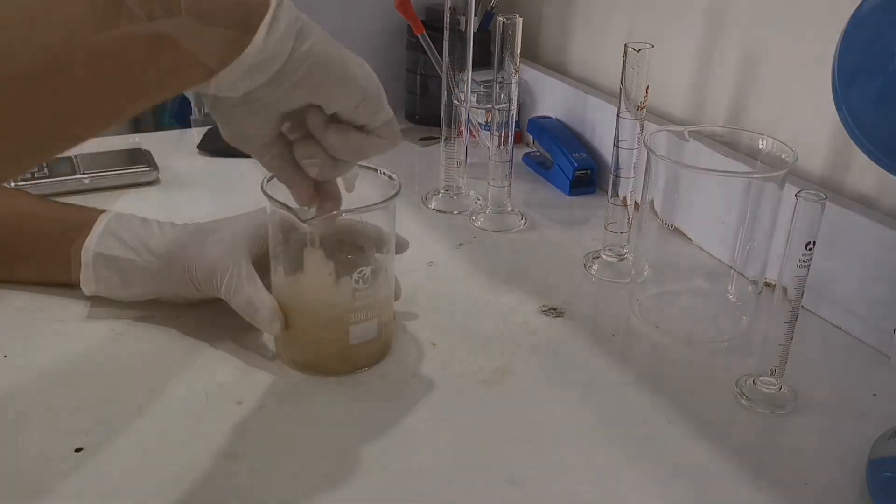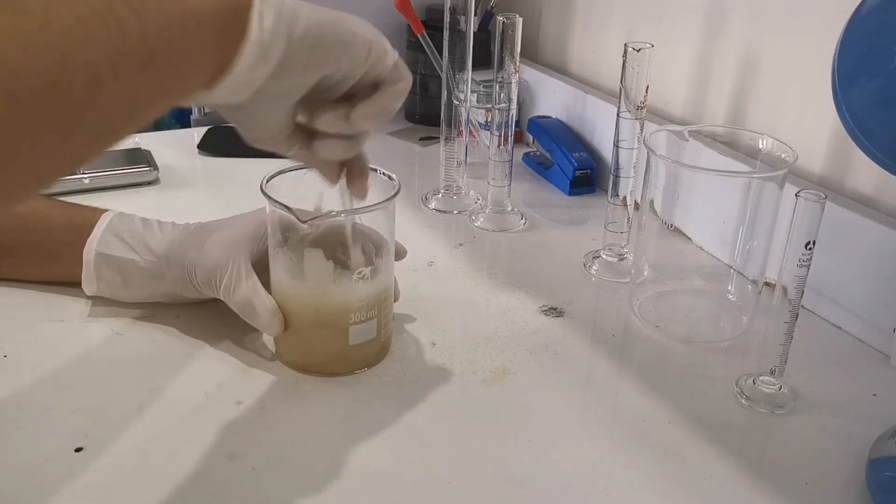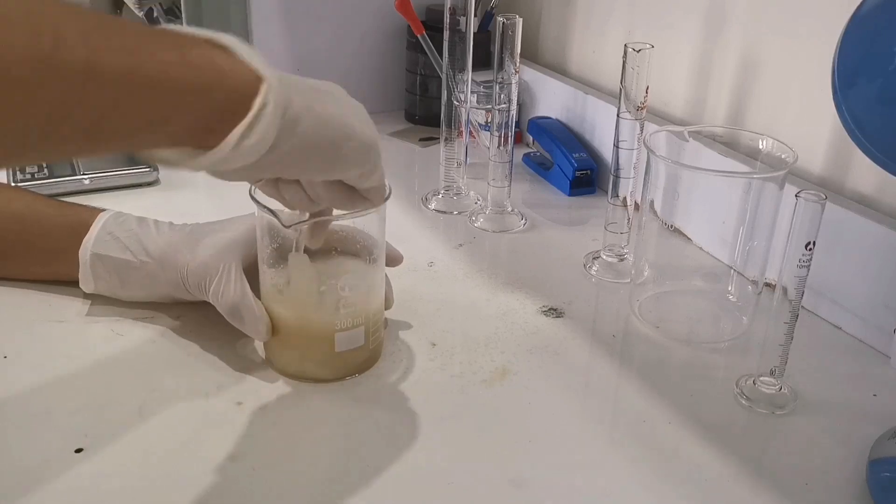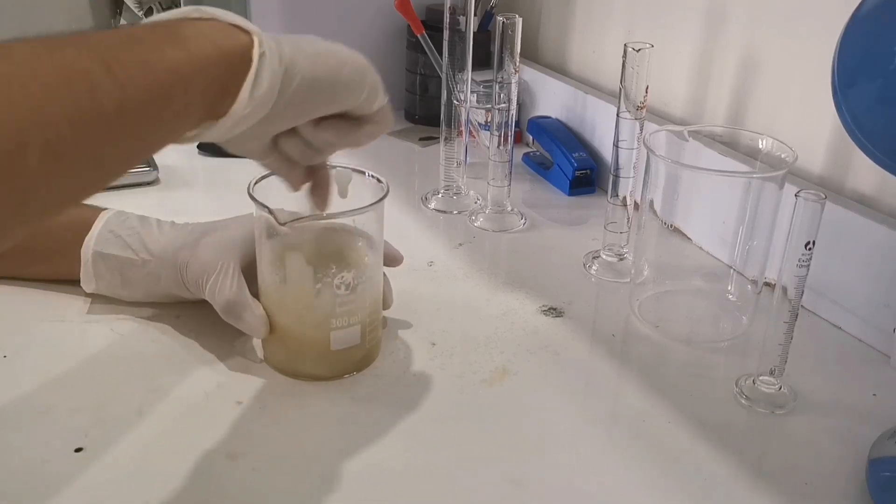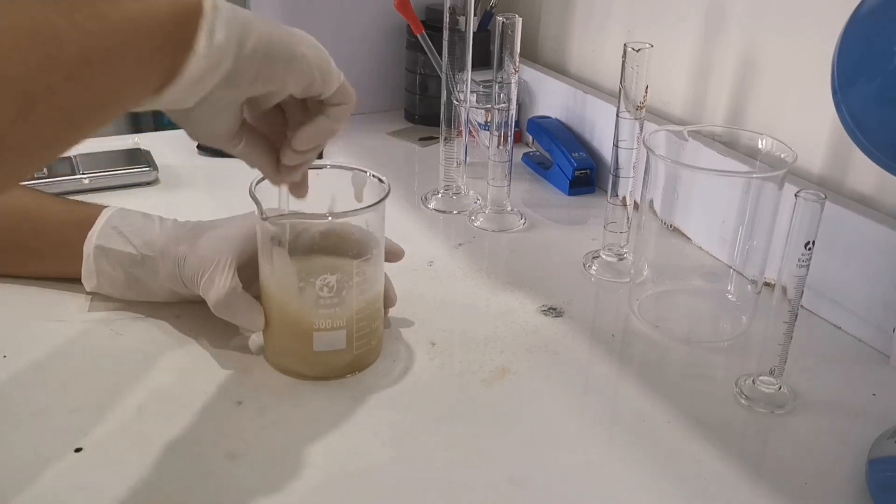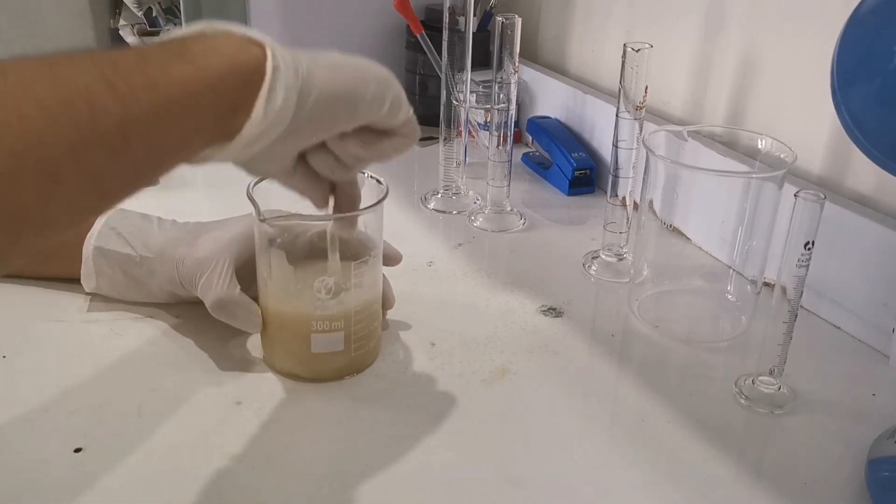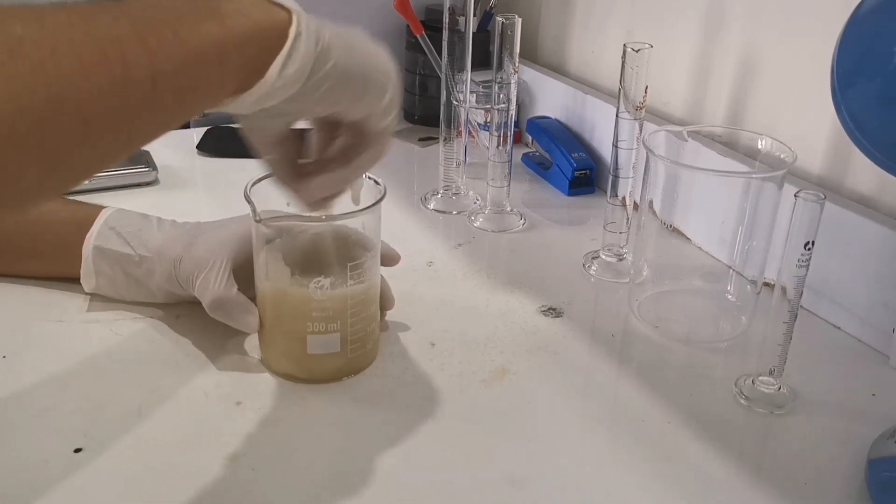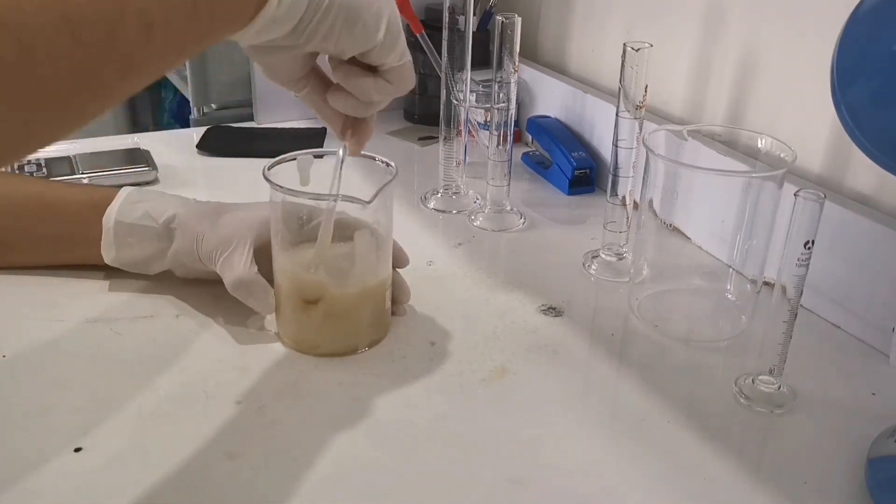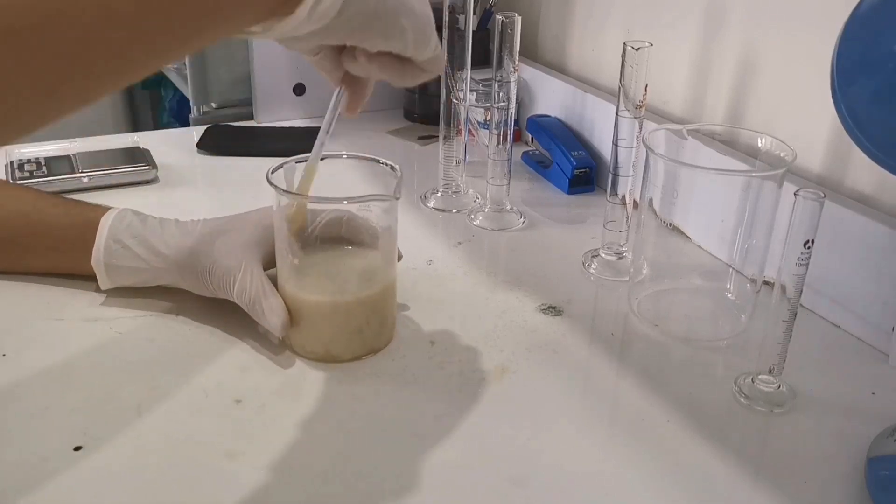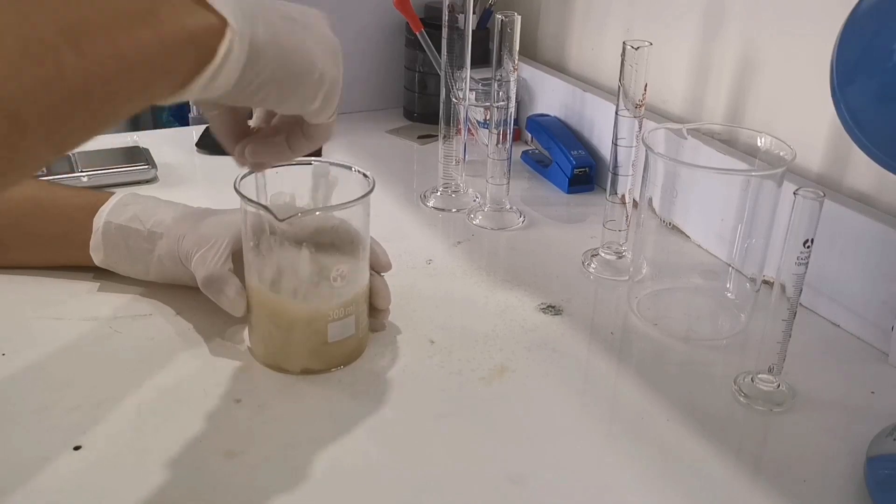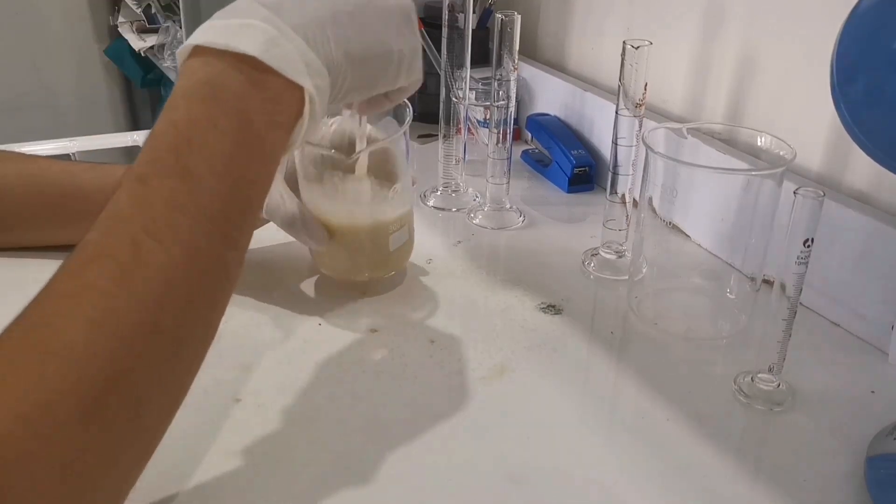After adding the ethanol, your solution will get much softer and your solution will be more white than before. Some of the glue is stuck at the bottom or the wall of the beaker. So it's important to scrape it off and mix it with the solution.